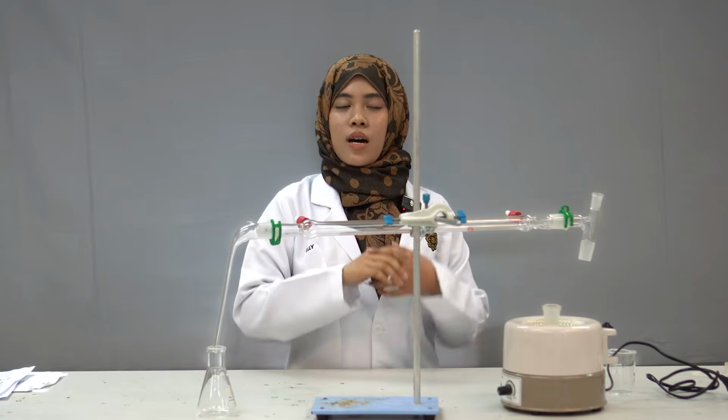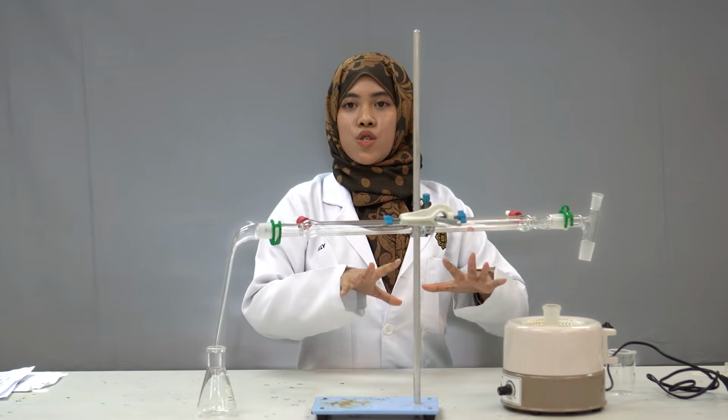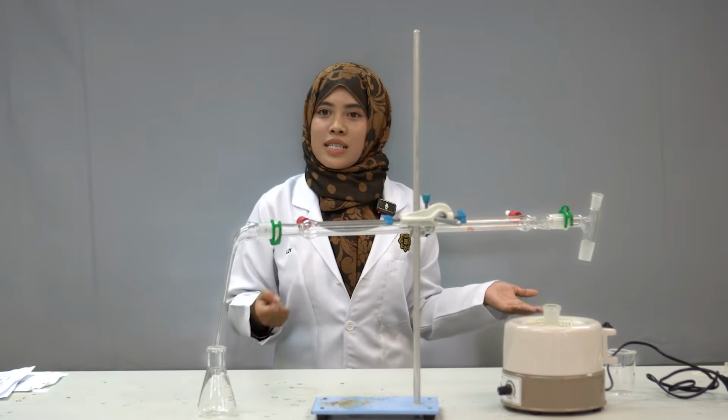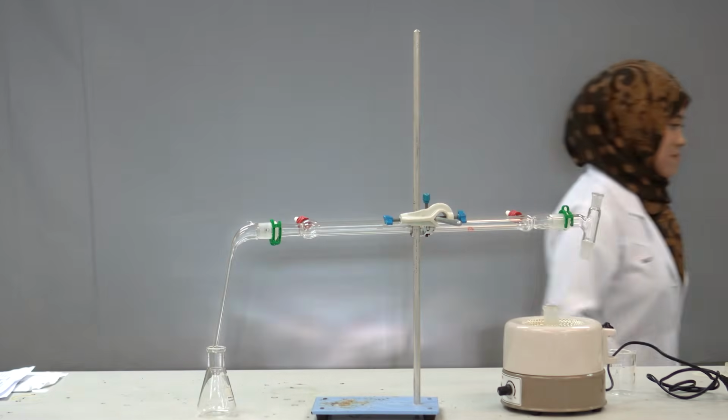Lastly, the most familiar to us, that is the simple distillation. Right here in front of you is the simple distillation. This one is used to separate and purify liquids having larger boiling point differences, unlike the one I have mentioned, the fractional distillation. So without wasting our time, we are going to learn more about the simple distillation. With that, I pass the floor to my friend, Sister Akma.